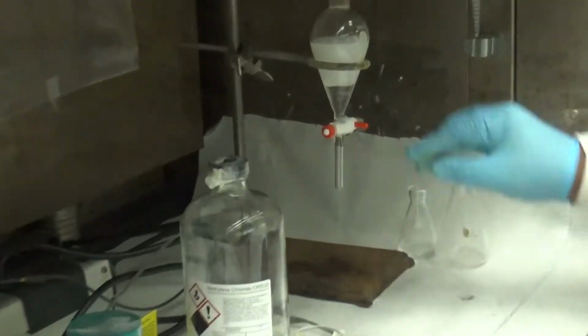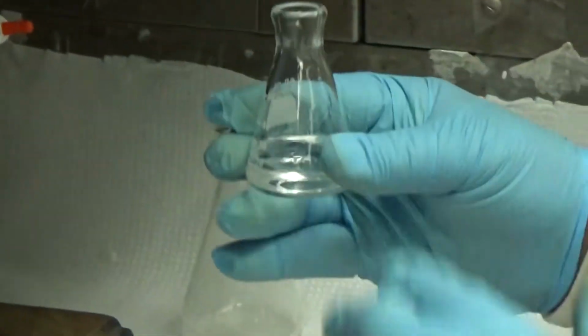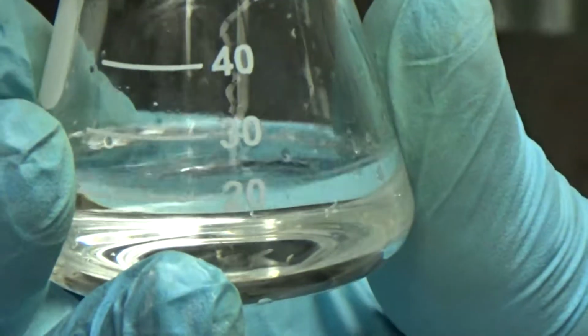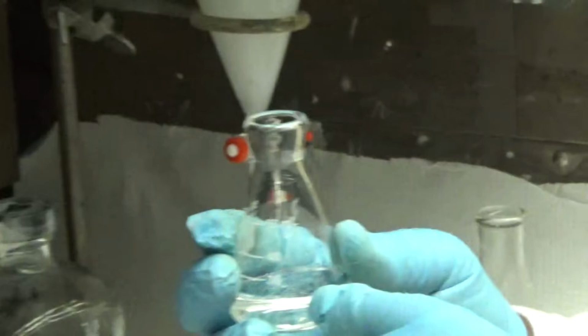So now I do the second extraction. Okay, here is your organic layer containing your eugenol. But your organic layer is still wet. Don't forget, you have done two extractions with water here, so there's a little bit of water in there. You still have some water left over.